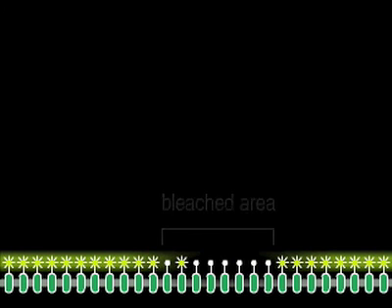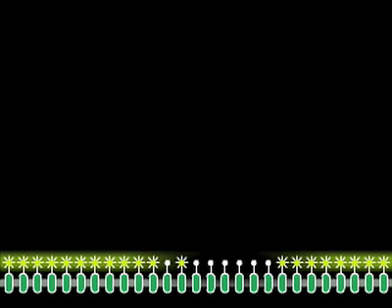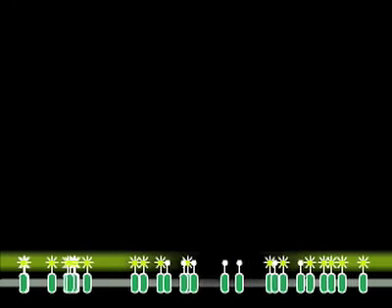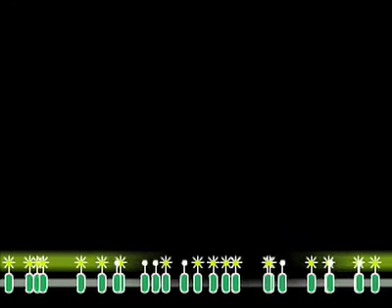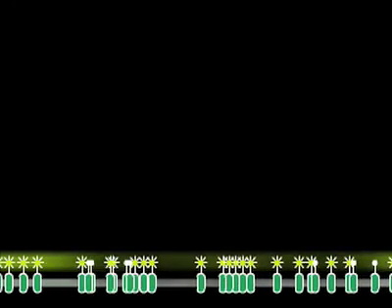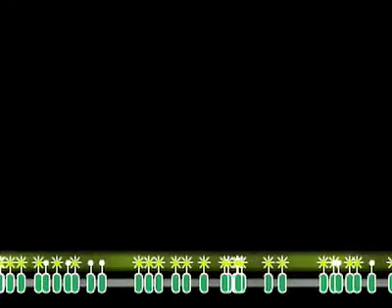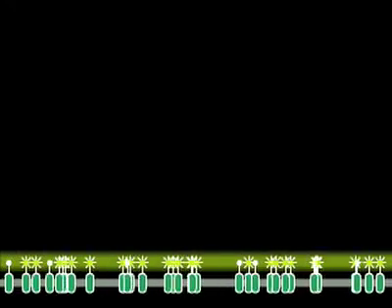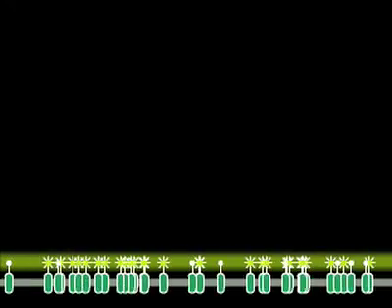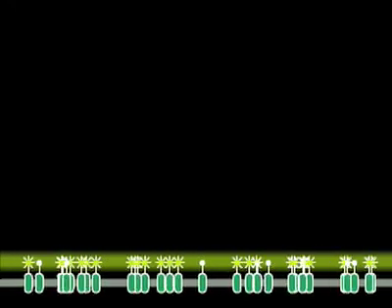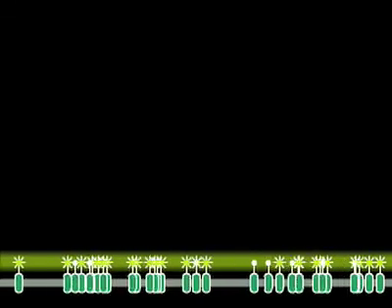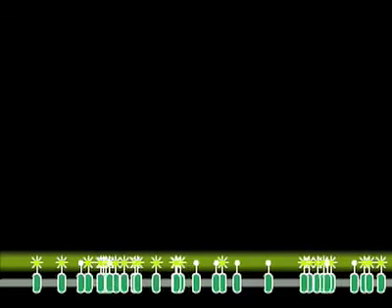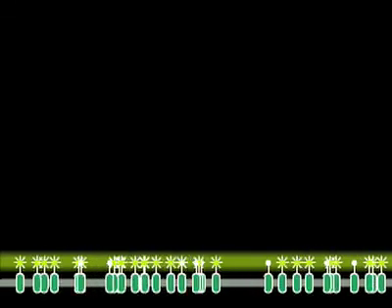Those membrane proteins that are not anchored, and therefore can diffuse in the plane of the membrane, quickly exchange places with their neighbors and fill back in the bleached area. From the rate of this fluorescence recovery, the diffusion constant of the protein can be calculated.